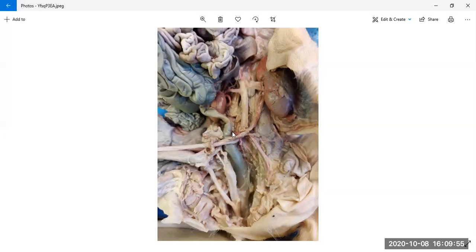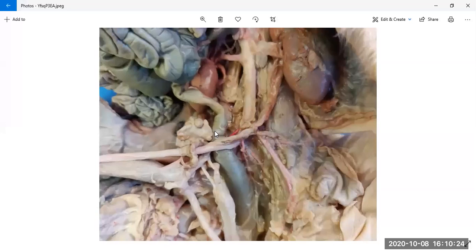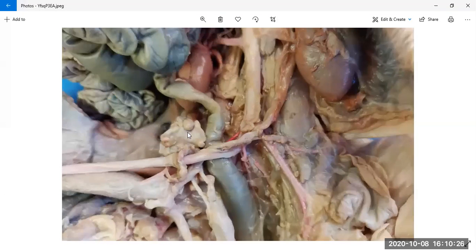On this area, we have the rectum, which is related to the large intestine. This is the end of the large intestine, the rectum. And then we have two tubes over here. If I have the picture right, and if you go up, you see these structures that look like tiny grapes. These look like the epididymis, which is found in the scrotum or the testes.